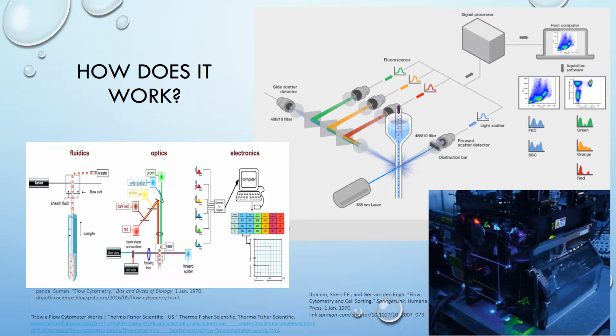If there's a fluorescence tag, like on protein, DNA, or RNA, then it will excite a light, and one of those lights will be a fluorescent color, either green, orange, or red. There are up to 6 different ones, as you can see on the electronics picture. Each one that's excited will send a signal to the processor, and it will also show on your computer results, your data. On the results, you can see a scatter plot, and it shows the size and also the fluorescence color present.